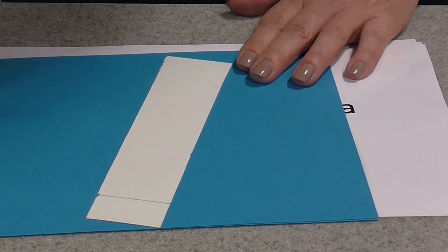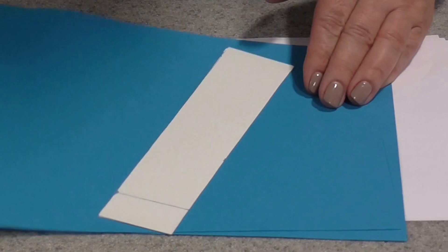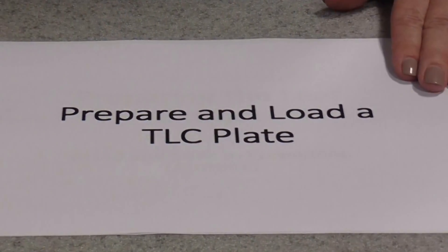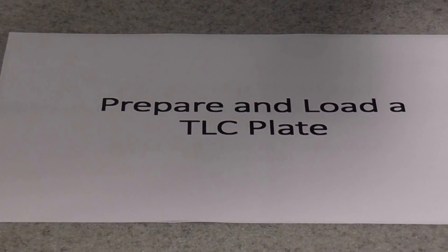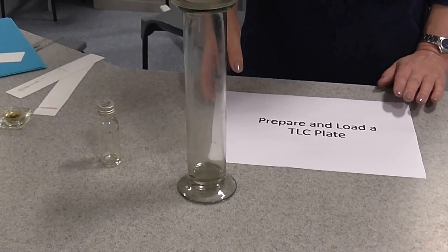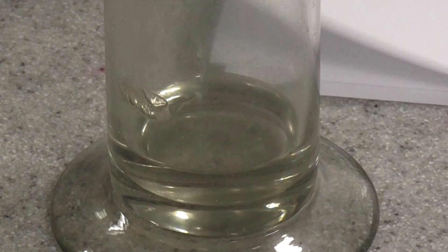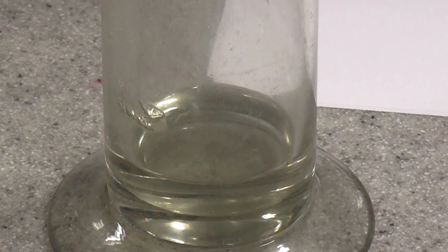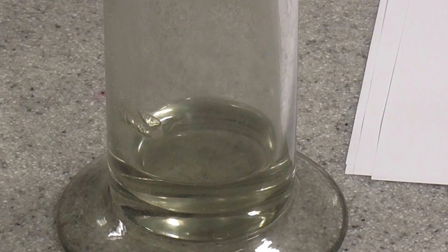While you're doing this, the next thing you could also do while you're waiting for your leaves to soak is actually put your solvent, which will be the mobile phase, into whatever vessel you're going to use for your chromatography. So I am using a gas jar here. Now, into the bottom of that gas jar, I've placed my solvent.